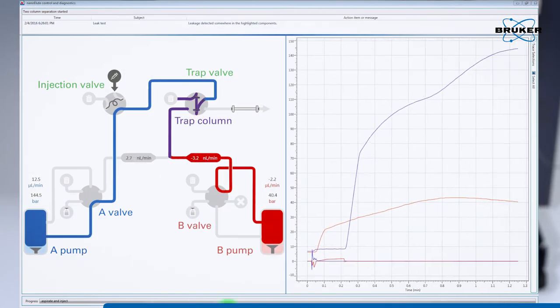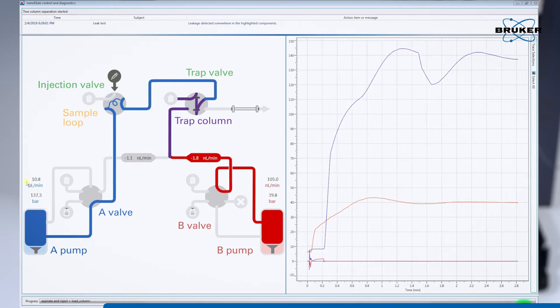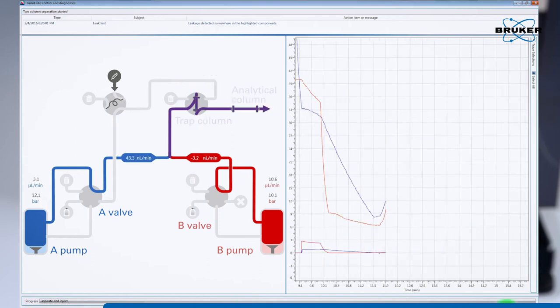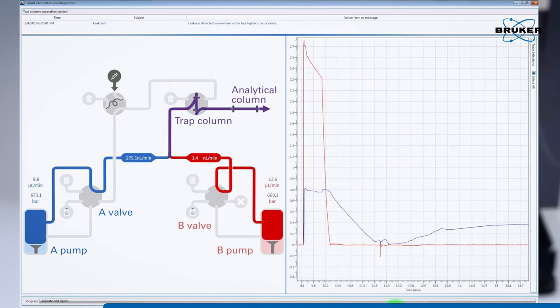The built-in quality control module tracks instrument performance and will recommend measures to maximize uptime for the combined LC-MS workflow.